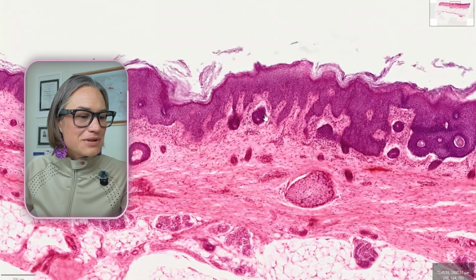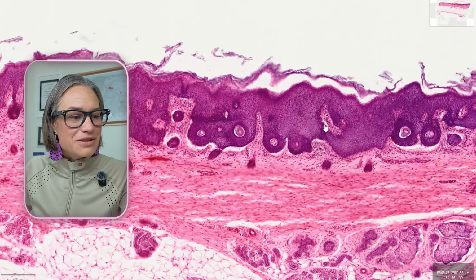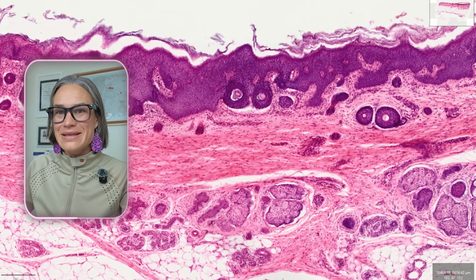So the goal is, this is supposed to be a high-yield teaching set. We're gonna compare skin and esophagus to help us compare the two stratified squamous patterns. Then urinary bladder is going to help us understand transitional epithelium, and salivary, or whichever gland I find, actually esophagus, I'll have to find along these slides as well. So I'm going to go a little higher magnification, but not too high in a second.